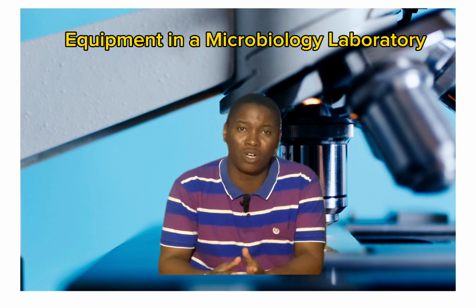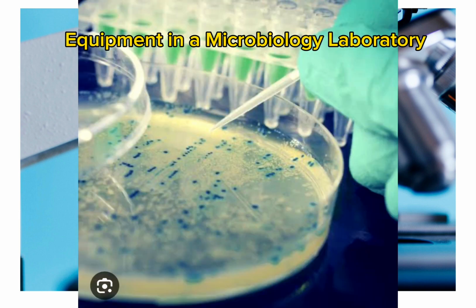You have the nutrient agar, which is the most popular. You have nutrient broth. You have blood agar. You have chocolate agar. These are all different kinds of culture media that support the growth of different kinds of microorganisms.